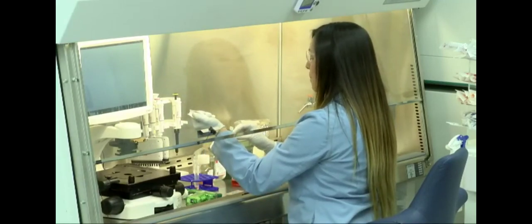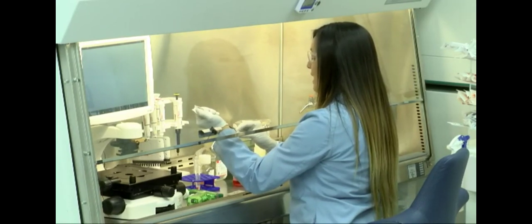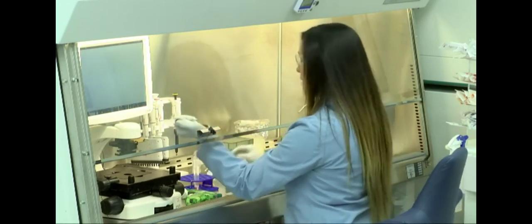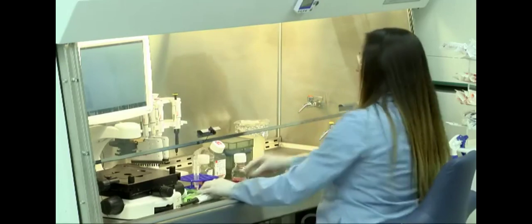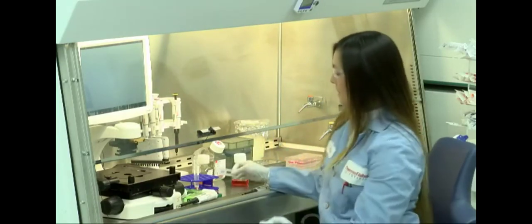Trypan Blue permeates the membrane of dead cells, being able to give us a live cell stain and a dead cell stain. So once I pipette this up and down nicely, we're going to take 10 microliters of that and insert it into the slide. And right here, you guys can see it's inserted nicely into the slide.